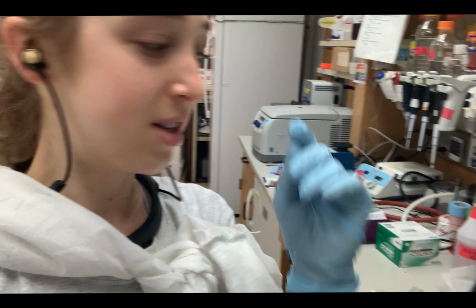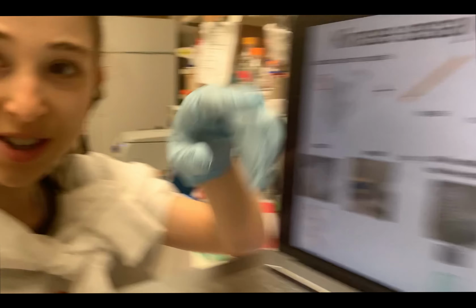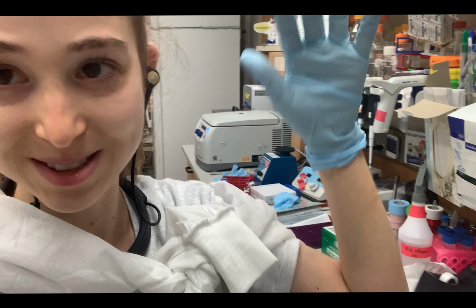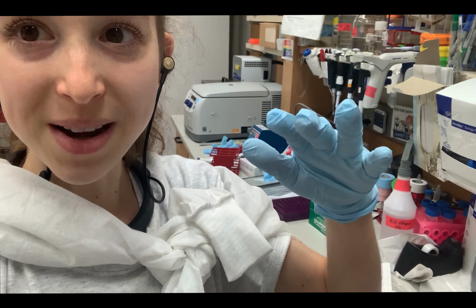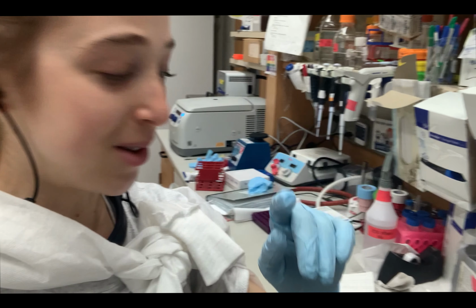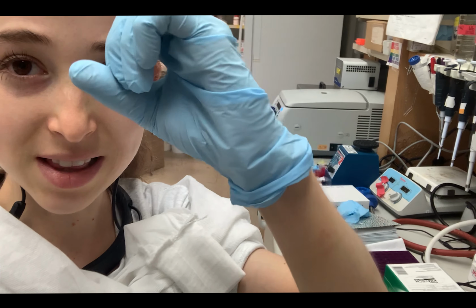I told you in the past about how we can detect it with things like autoradiography, where we put a screen on top, and the screen captures the energy in this metastable state, and then you shine light on it in a scanner, and it lets off light. Well, we're not going to use that for this. For this, we're going to use the scintillation counter, which is a really old machine that I'll show you more later. It's seriously super old school, and it has a dot matrix printout. It's pretty cool.